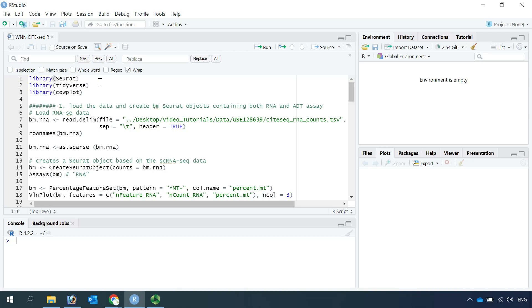First we need to load the packages: Seurat, tidyverse, and cowplot.